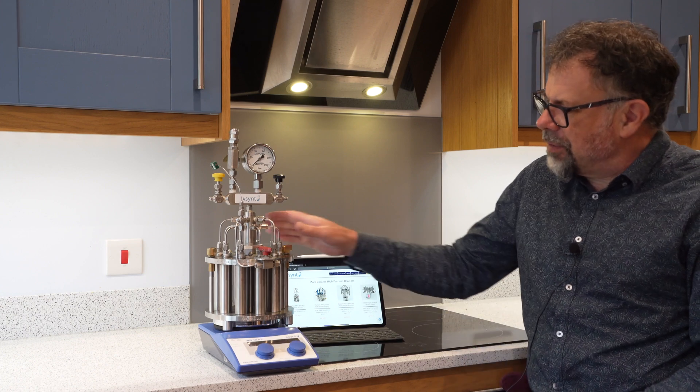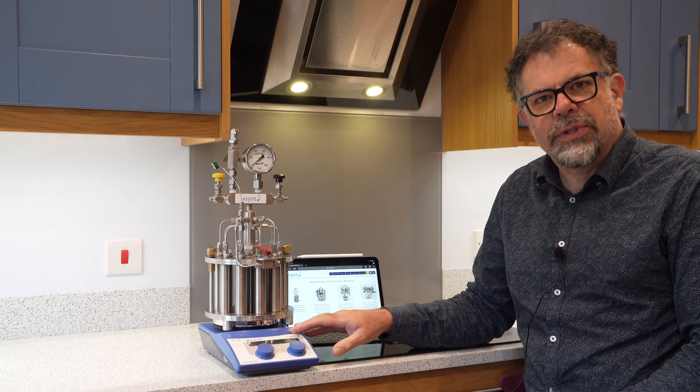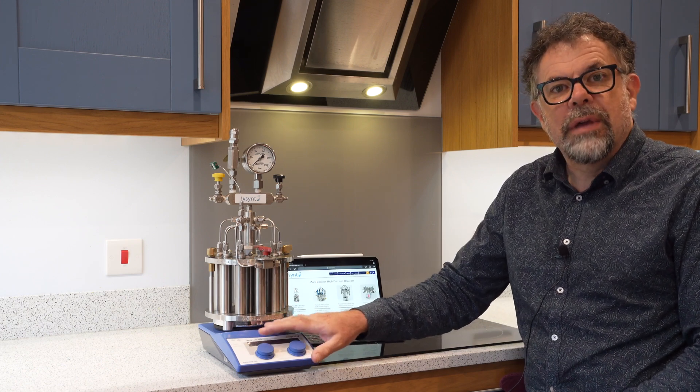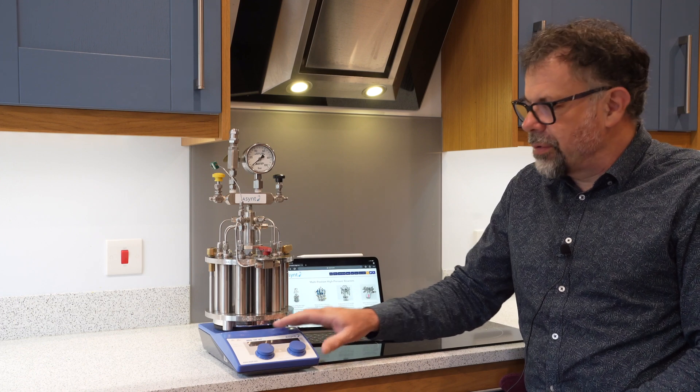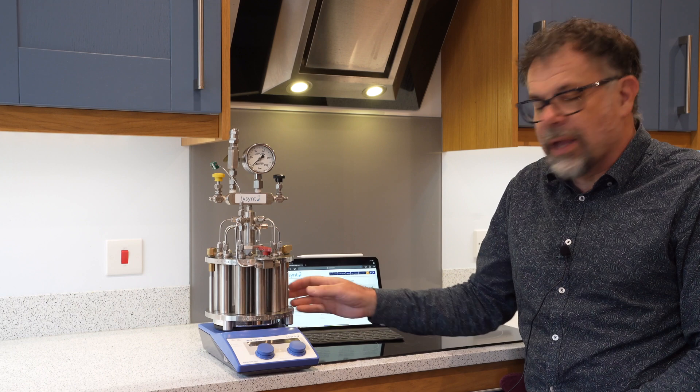MultiCell, just like many other Ascent tools, sits upon a standard magnetic hot plate stirrer like this one. So heating up to 200 degrees centigrade is possible, and magnetic stirring with standard stirring bars.